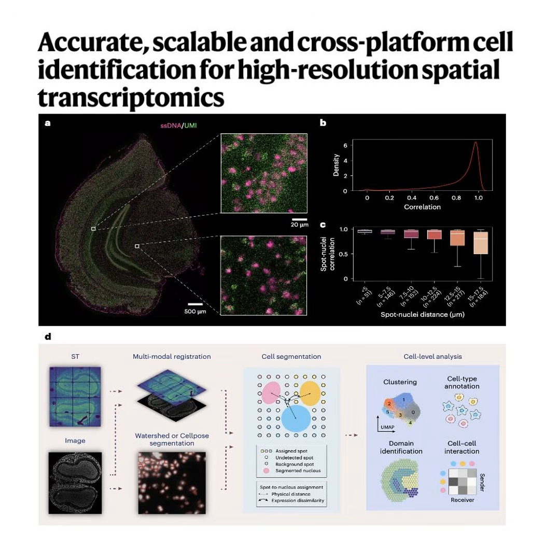Okay, but what if you're dealing with a really dense, complex tissue, where the nuclei are just crammed together and overlapping? A simple topographic map won't cut it. Right. For that, Cellist can switch to CellPose. That's a specialized deep learning model trained specifically on complex cellular morphology. Got it. Okay, so we have our anchors.